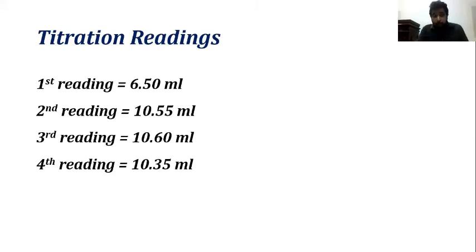So when you are doing the calculation, are you going to take all the 4 readings? So what are you going to exclude? Okay, I am going to exclude. Definitely, we have to exclude the first reading.